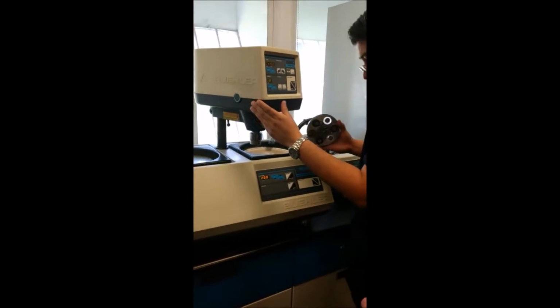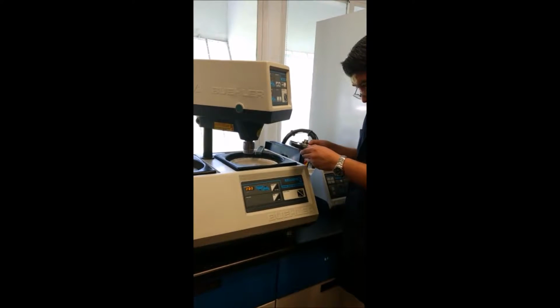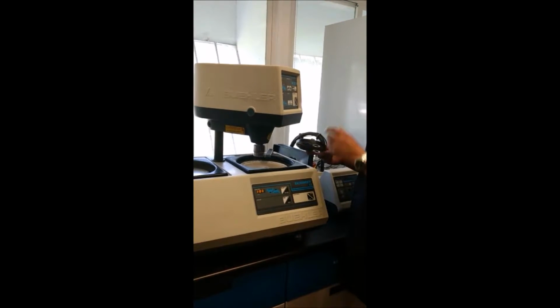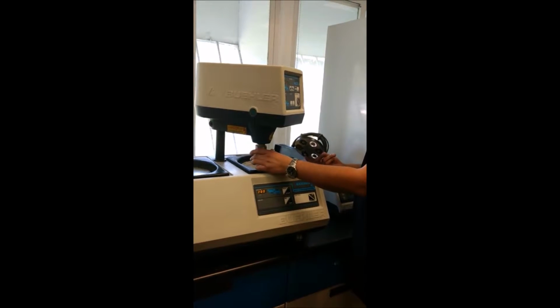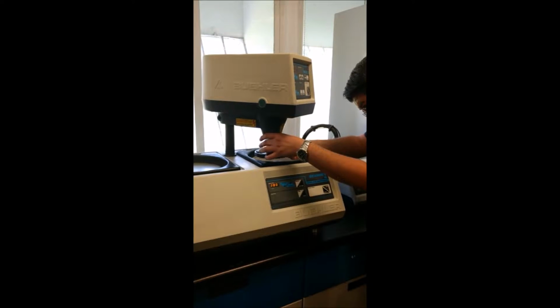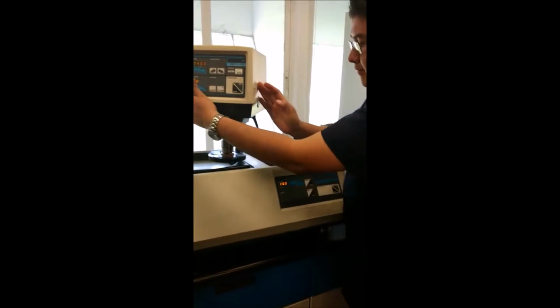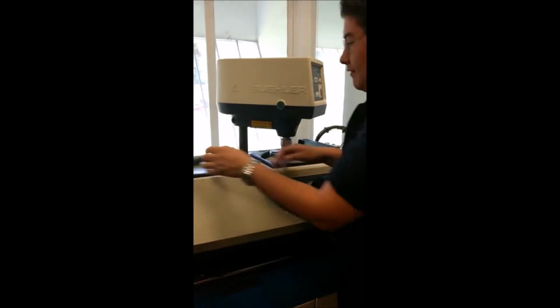And with 18 pounds, 200 revolutions per minute, sandpapers of 240, 320, 400, and 600, the same 4 minutes in each one for steel. This process was important to minimize the grading of the pieces. During this process, it was necessary to add some water drops to avoid temperature elevation.